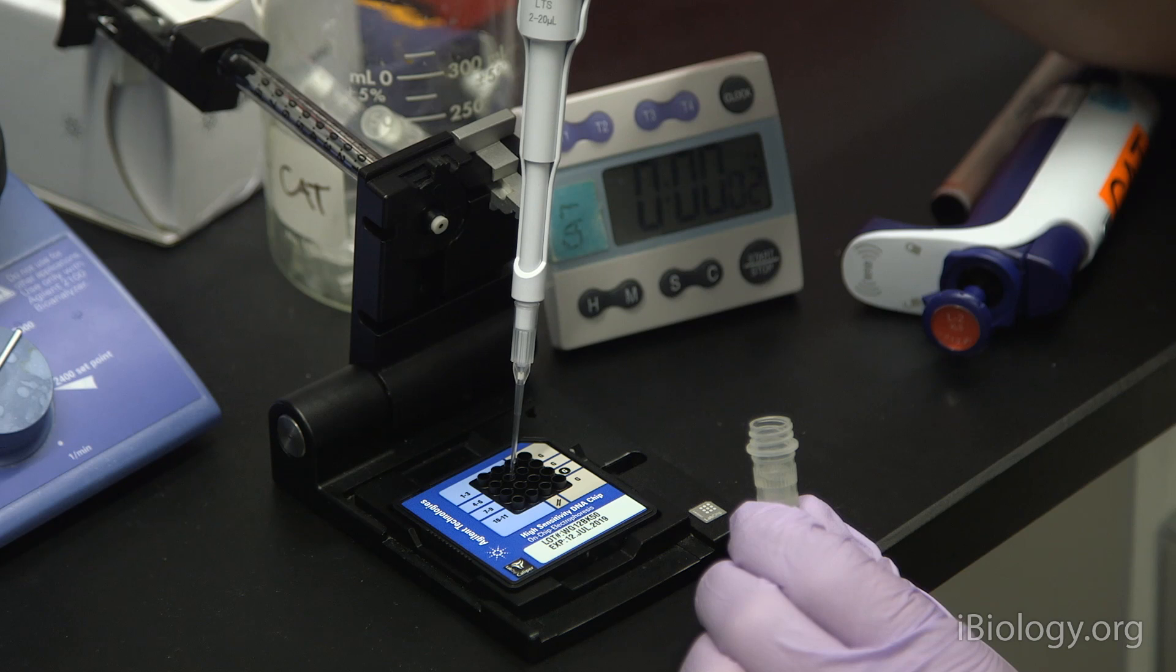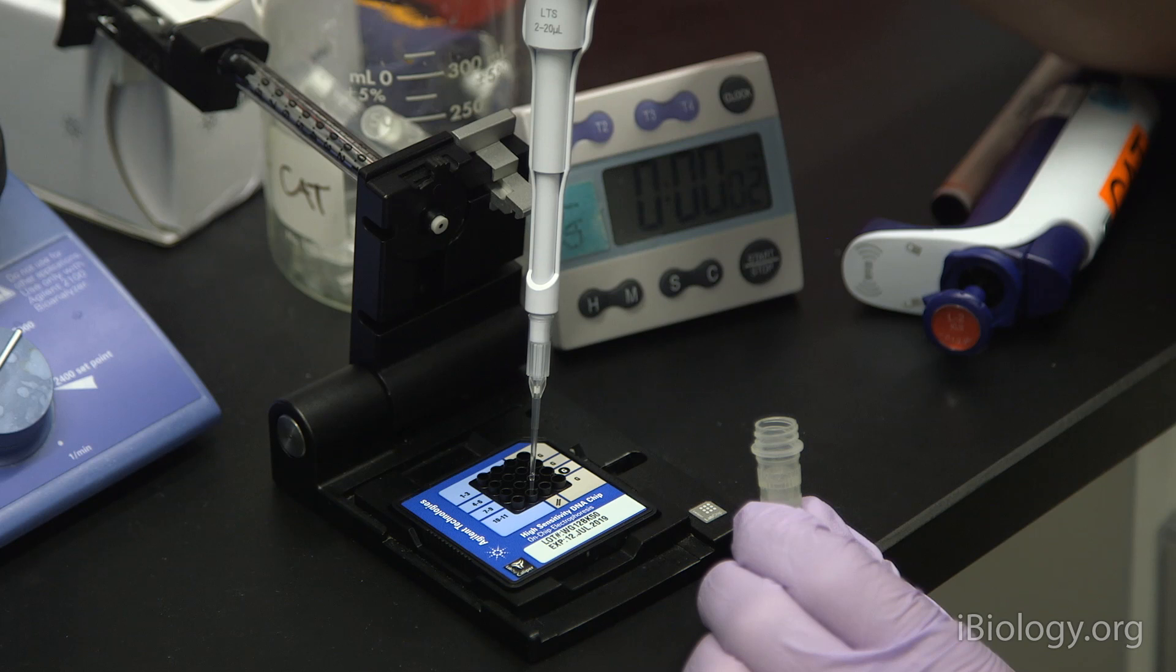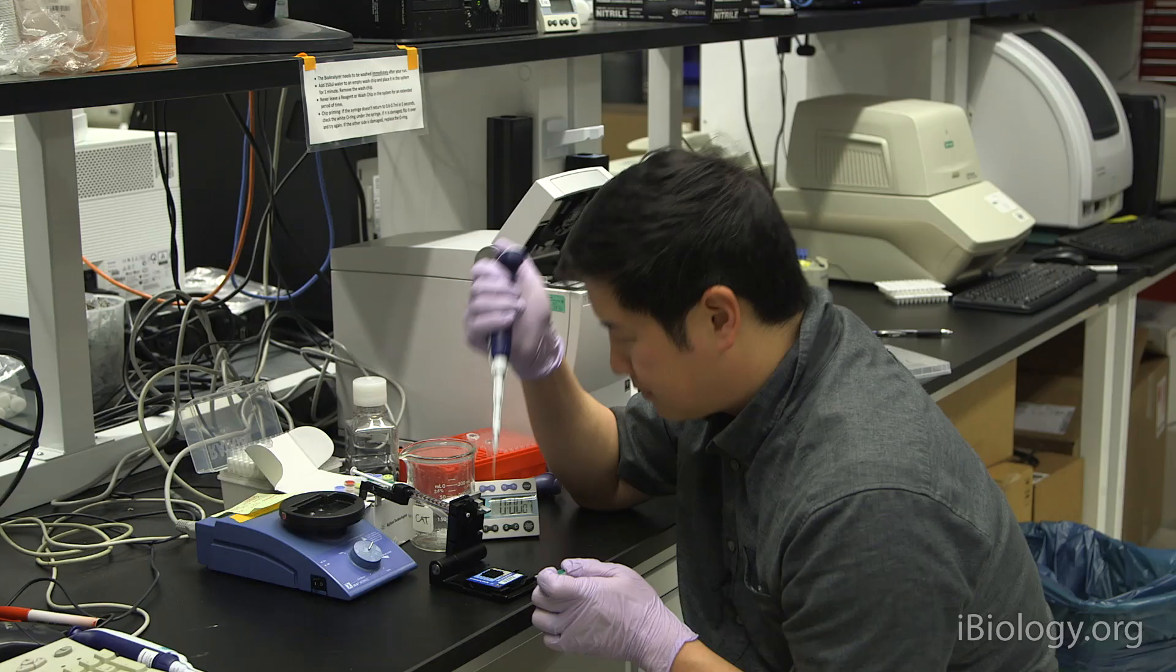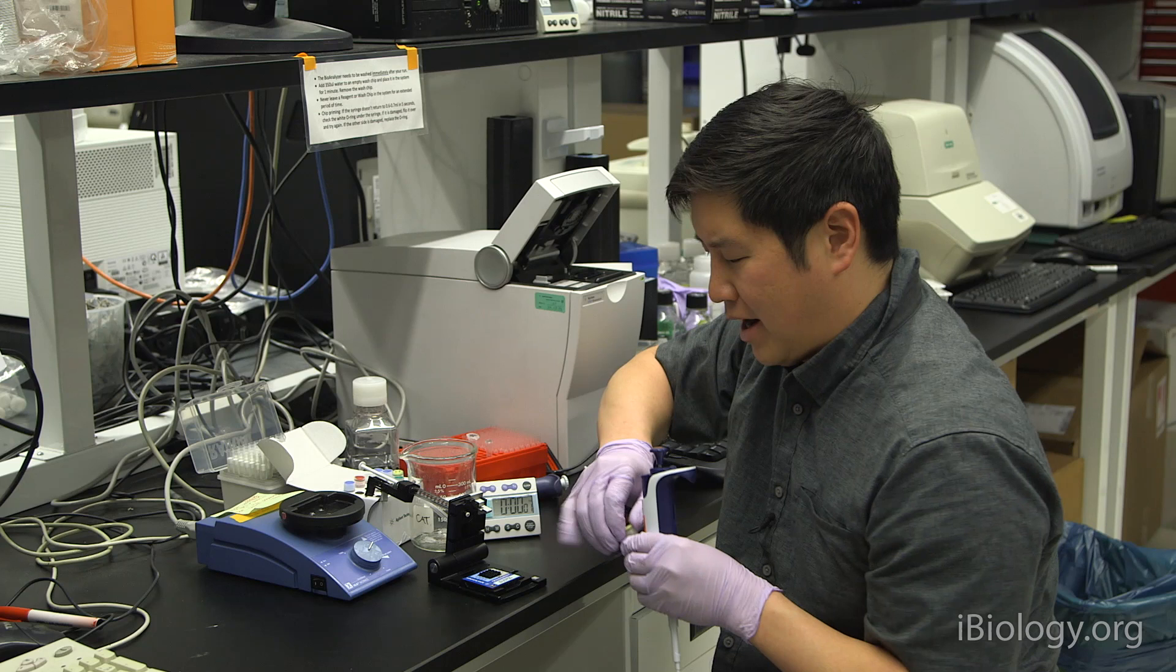Even if you're only running one or two samples, or not a full 11 samples, you still have to add marker to all of the lanes, or to all of the wells. The next step, we'll add one microliter of the ladder to the ladder well, and this is marked on the chip.